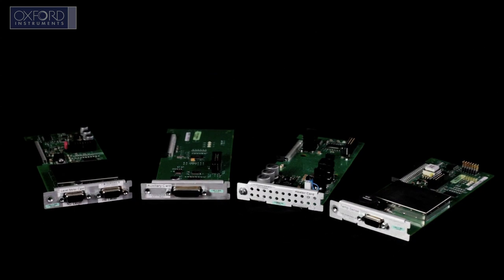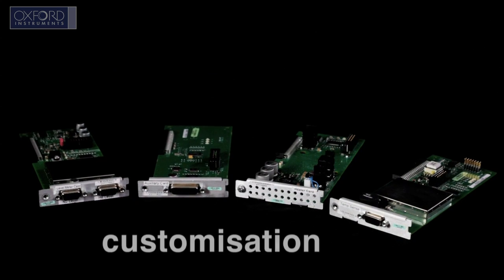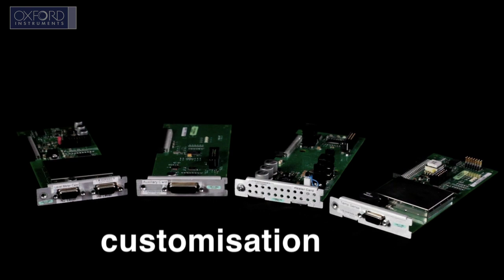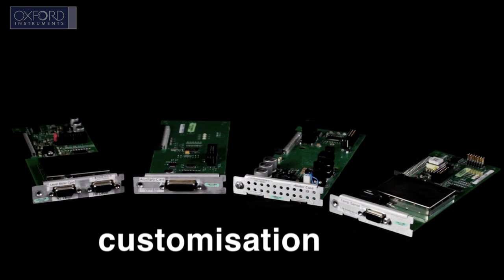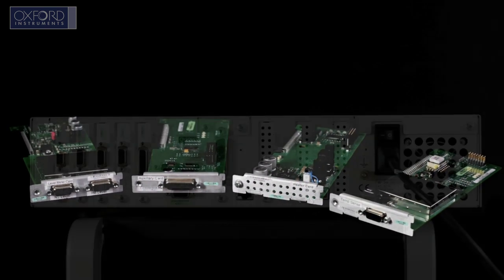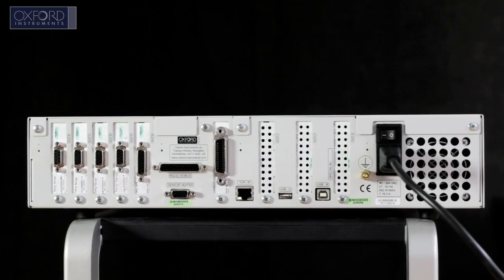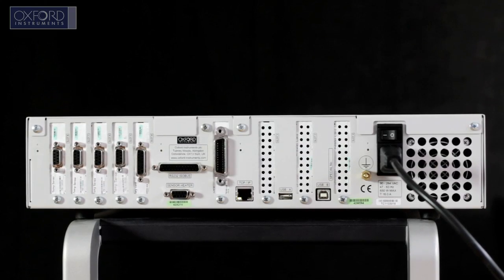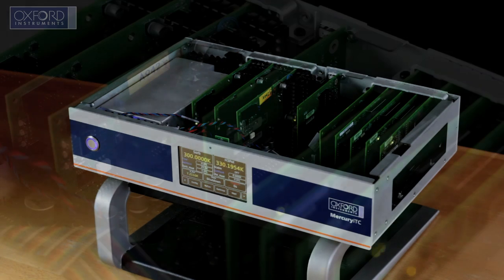The Mercury ITC allows for customization through the addition of plug-and-play expansion cards. The controller features eight expansion card slots, which can be used to extend its capability.